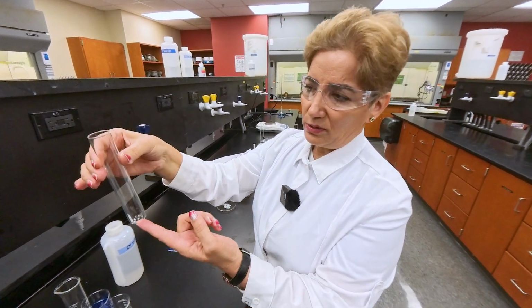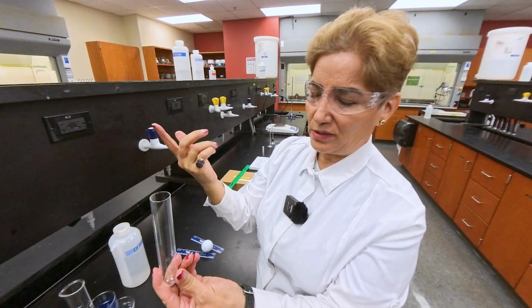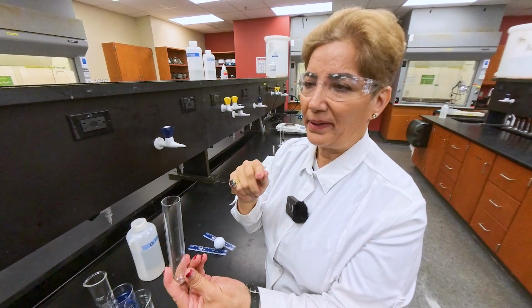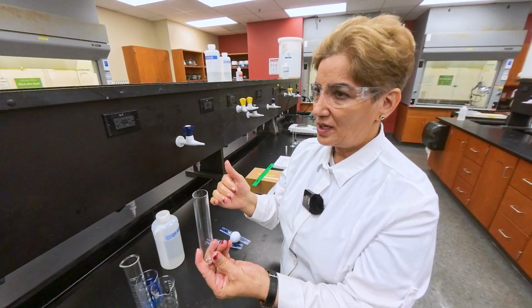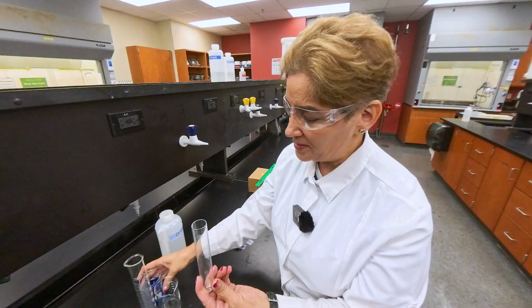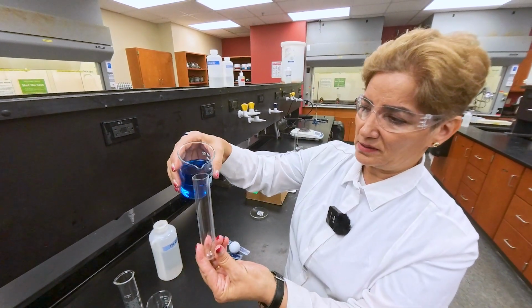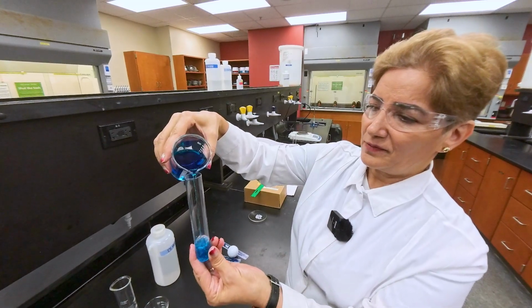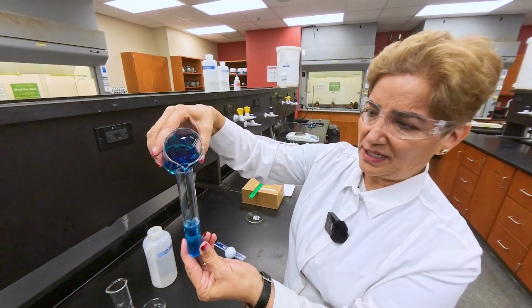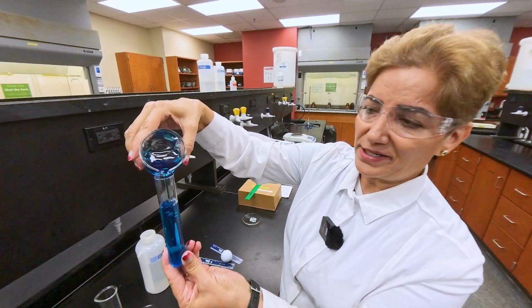Basically, in order to find how much liquid it can hold, I have two ways to do this, and when you read the lab manual, it tells you what you can do. One of the options that I use here: I fill up the test tube to the rim, all the way to the top, and find out how much liquid that is by measuring the volume using a graduated cylinder.